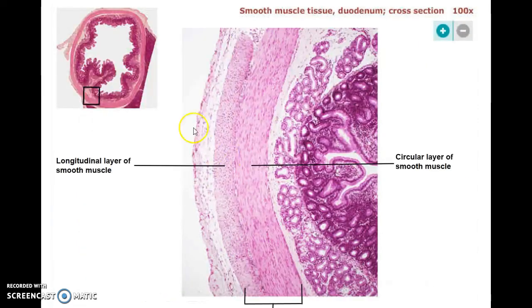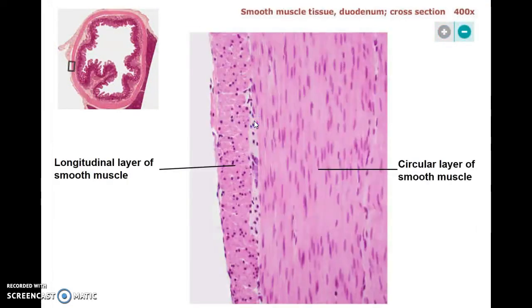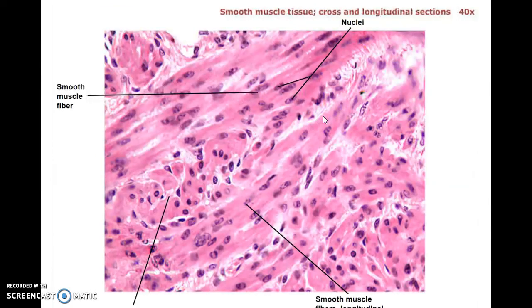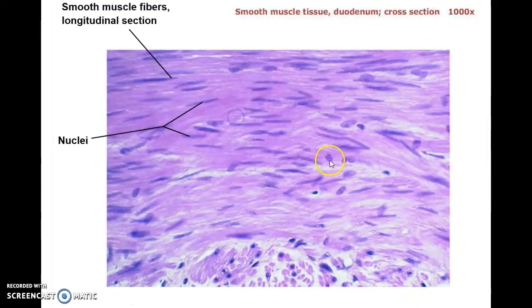Now we're on to smooth muscle tissue. This is the wall of the intestines — you can see the entire intestine that's been cut across here. Under slightly higher power you have a nice layer of smooth muscle tissue, and up close you can see it has a much more indistinct form. There are no striations; the cells kind of jumble on top of each other. They are single-nucleated cells. Here's another view of those smooth muscle cells.